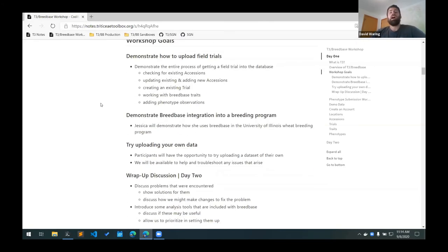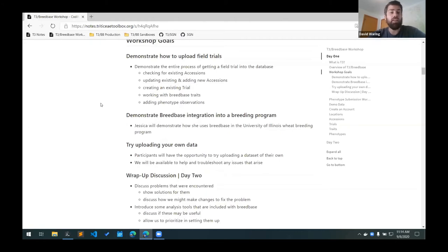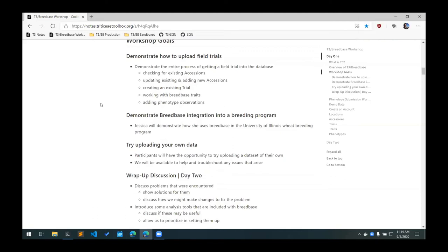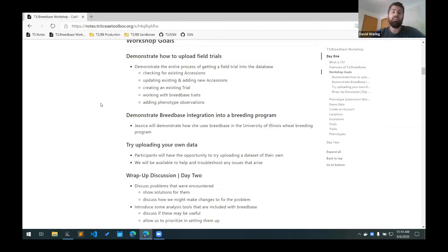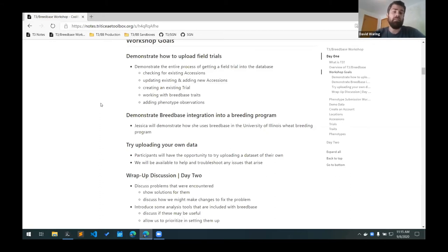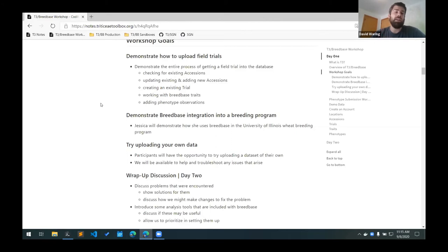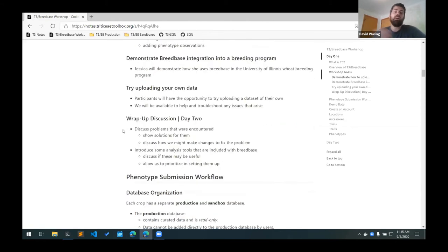The goal of this workshop is going to be hands on. I'm going to be giving a live demonstration on how to upload field trials to the database. I'm going to go through the entire process of checking to see if your germplasm records are already in the database, how to add new accessions to the database, how to create an existing field trial. The use case I'm going to be working through today is you already have a field trial design. You already have data for phenotype observations for that field trial and you want to get that data into the database. We'll be working on creating an existing trial and adding that to the database as well as we'll talk about how Breedbase manages traits and how it's a bit different than how we used to manage traits on T3 Classic. And then finally adding those phenotype observations to the database for those trials.